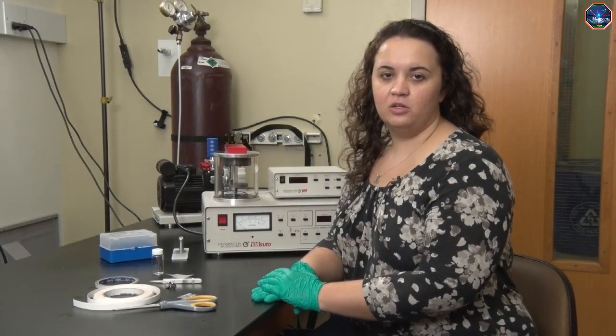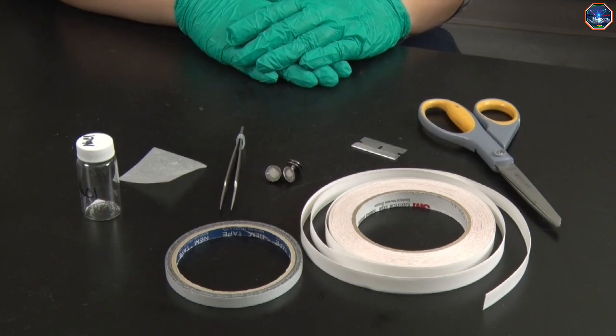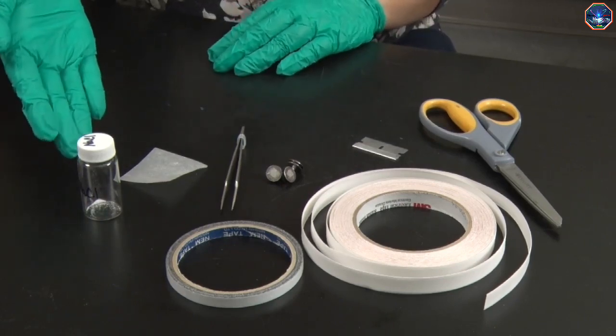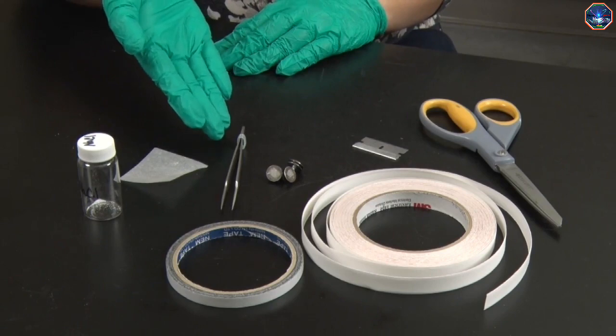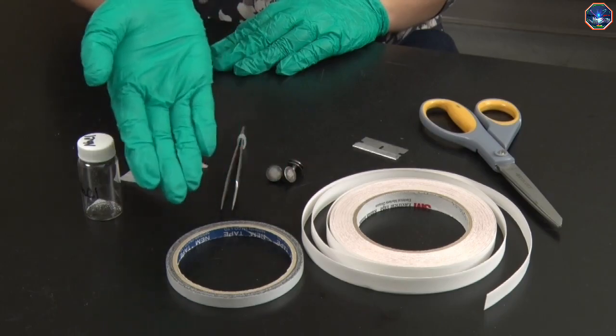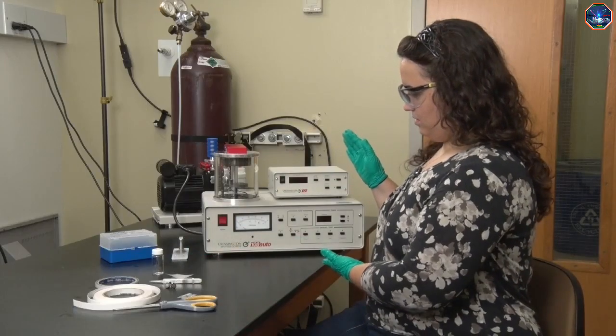Welcome to the SEM lab. Today we will be imaging some salt crystals. The tools that we will need to prepare our sample for imaging today include the sample, tweezers, sample stubs, conductive tape — two common types are carbon tape and copper tape — and possibly a sputter coater.